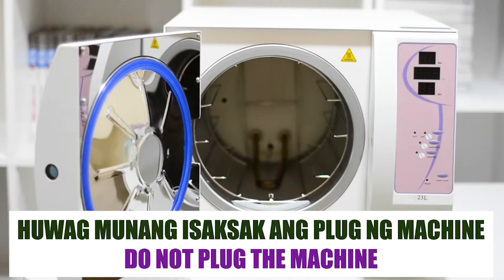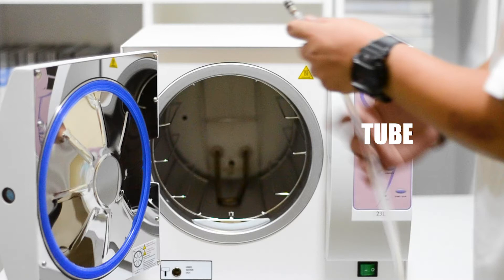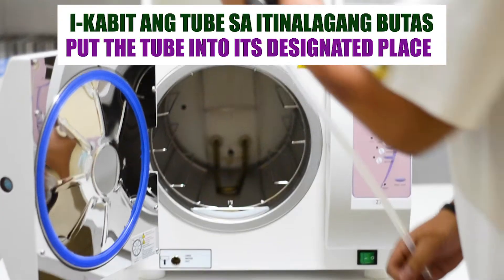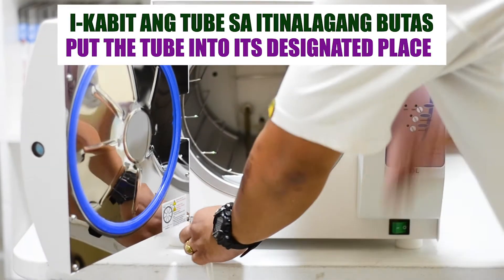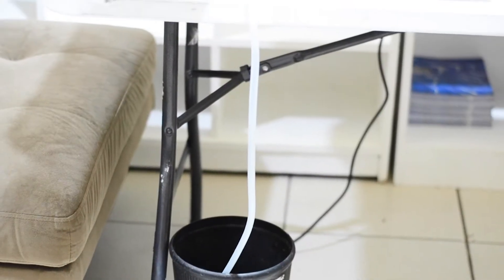How to use the autoclave steam sterilizer. Do not plug the machine yet. Put the tube into its designated place, and place the end of the tube in a container to catch any excess water.